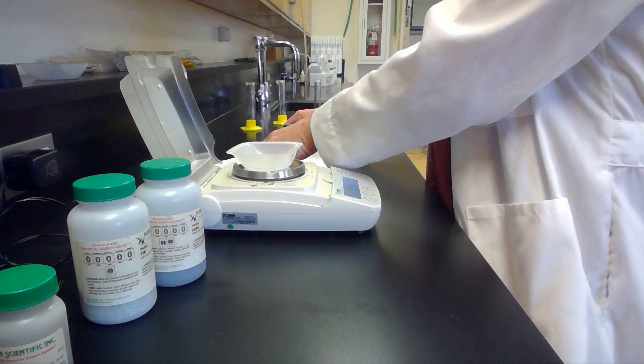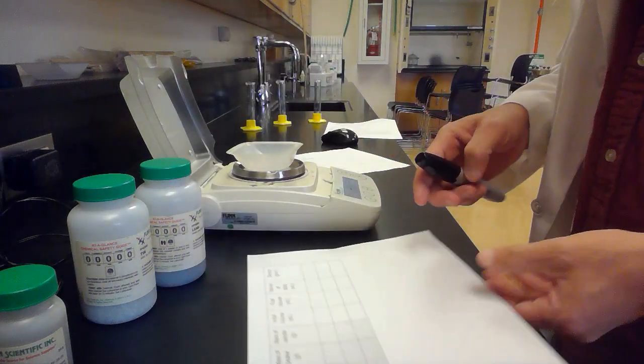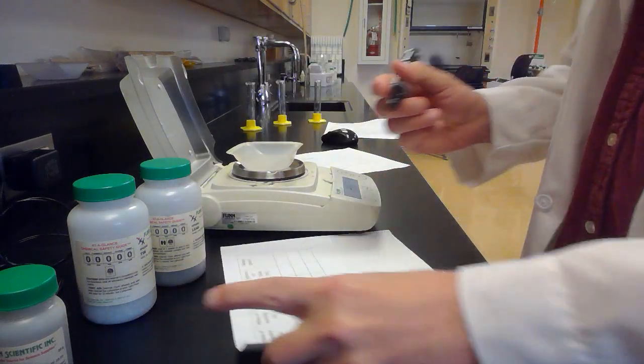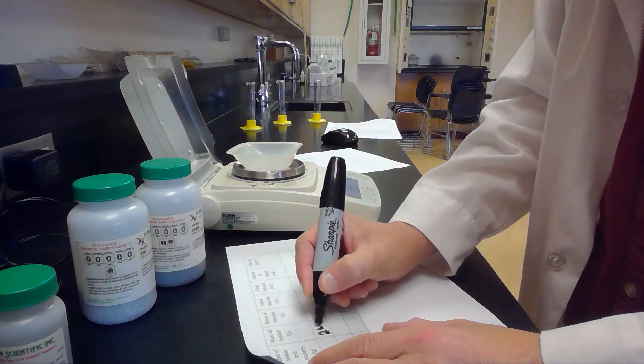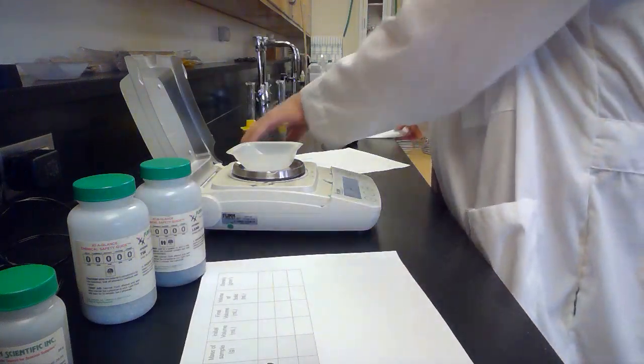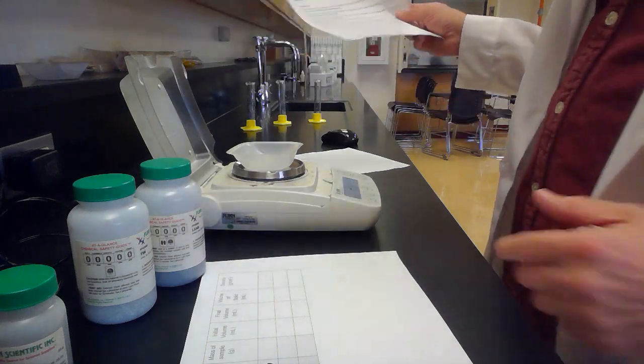So I'm going to take my data table, and you guys can find this in your handout. I have here my data table. And this is the mass of the beaker, which is 2.46 grams. Okay. Now my instructions say, obtain approximately 8 grams of silicon chunks.